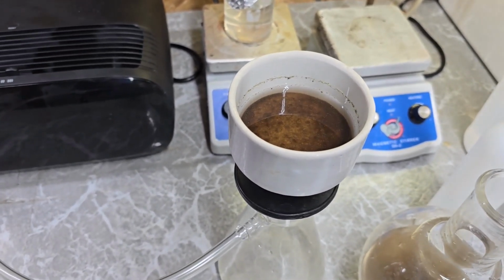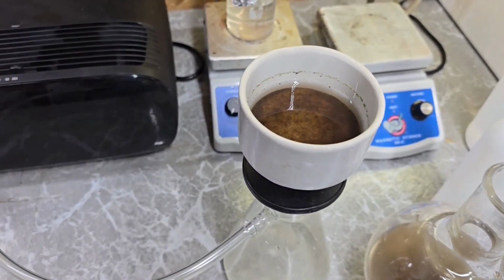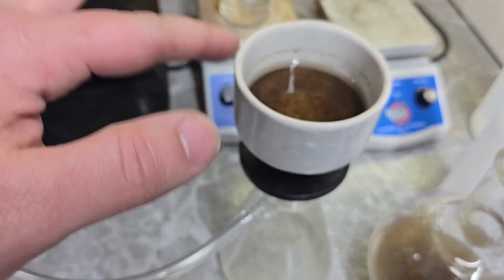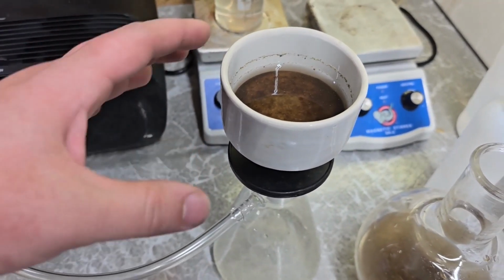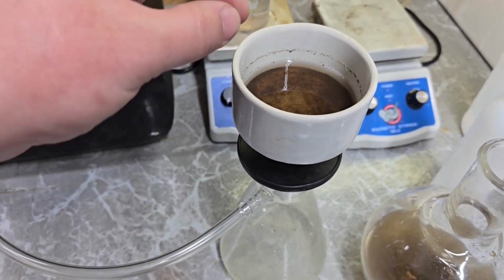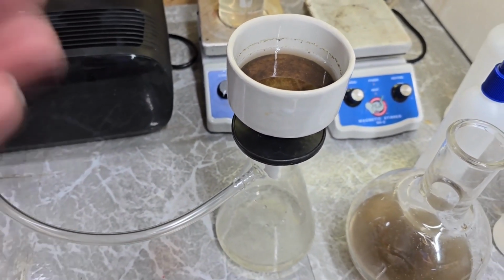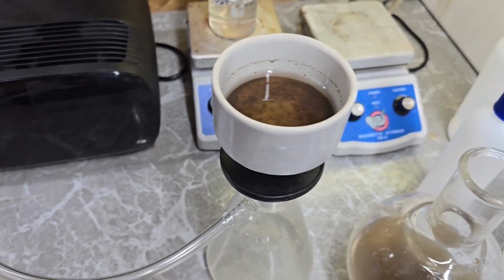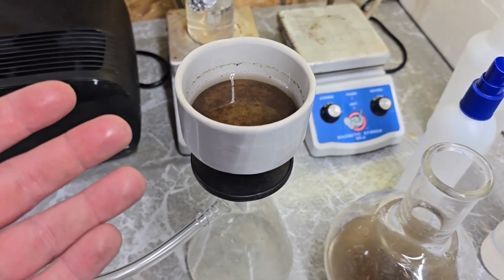I don't want to turn this vacuum pump off until I get this out of here. But I'm going to siphon this water off with the pipette, and then I'll let the little bit left filter through the paper. That way I can peel the paper off without the water down here. I mean, it doesn't really matter, but that's what we're going to do, just because I don't feel like waiting another 20 minutes for this to filter through.